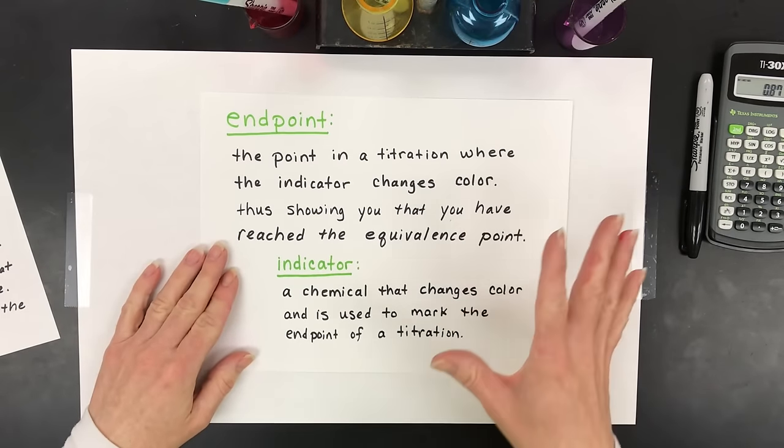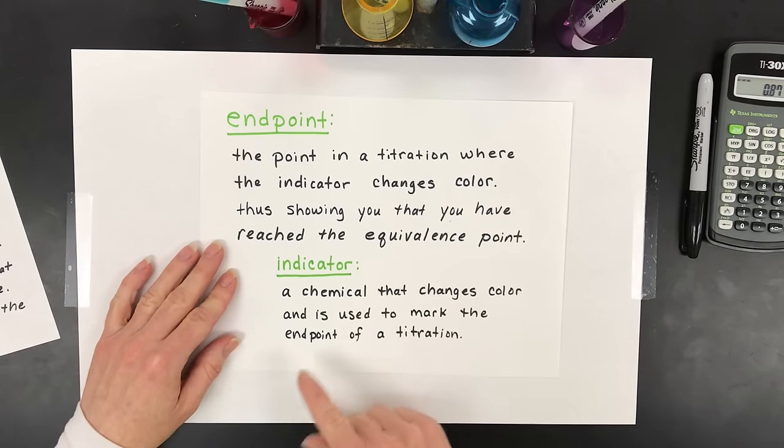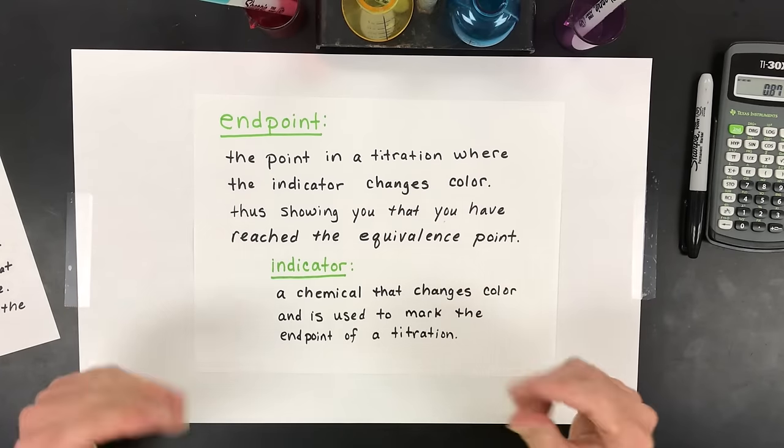Another term is endpoint. Endpoint is actually different. It's when the indicator changes color and it shows you that you've reached the equivalence point. And the indicator is just any chemical that's going to change color to kind of signify that you've reached that.